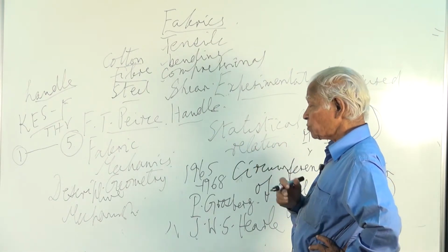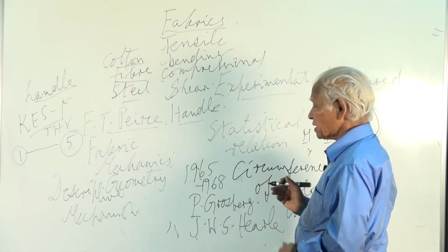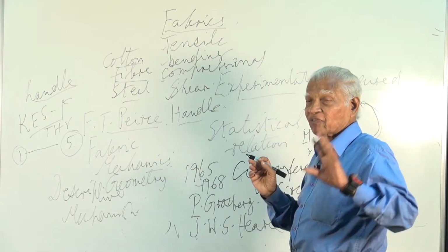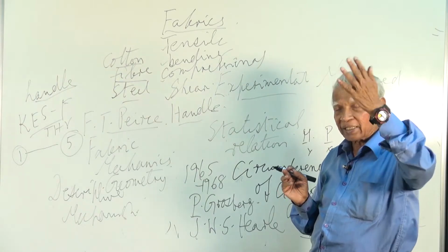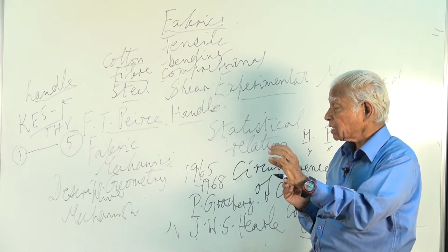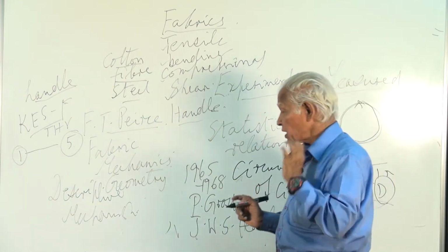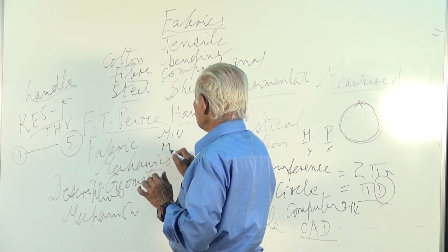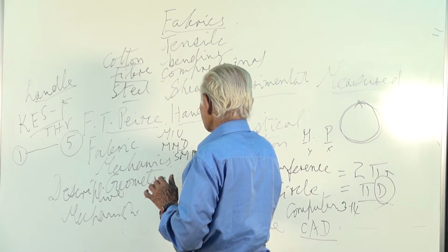the various mechanical properties, because there are 4 groups in this Kawabata evaluation system, or 4 different instruments are there. One instrument for bending, the other instrument for shear and tensile, both are given by the same instrument, and we have one compression tester and we have the surface roughness tester which gives the coefficient of friction, that is MIU, then MMD is the variation of friction, then SMD is the surface roughness.